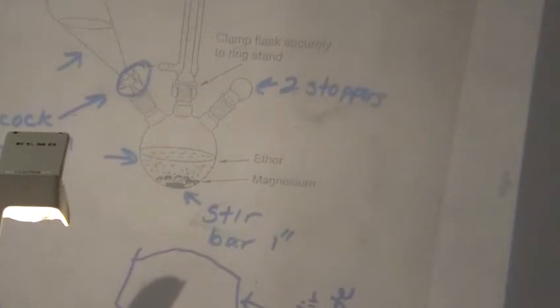So you're going to start with, first of all, this glassware is going to go in the oven before lab this week. So the morning labs at 7:15, we're going to start loading the ovens, and we want them loaded before lab starts at 7:30. In the afternoon labs, you're going to want to come in before your afternoon lab and get it all loaded before 1 o'clock, okay? So make sure you're on time, because we can't start counting the heating time until the oven is closed permanently and we're not adding anything more to it, okay? And if you're late enough, we won't put your stuff in the oven.